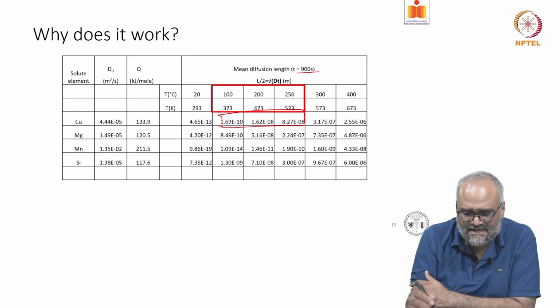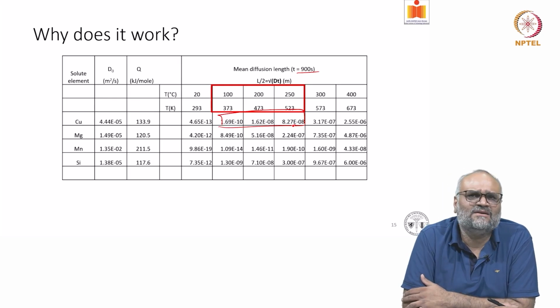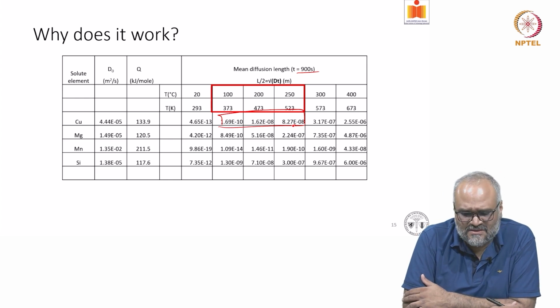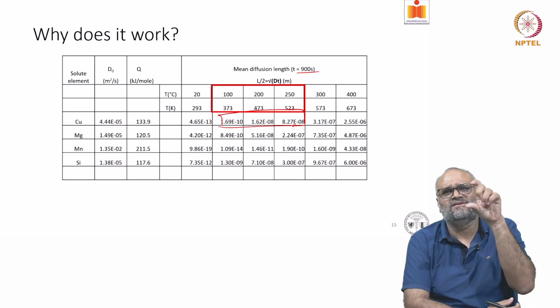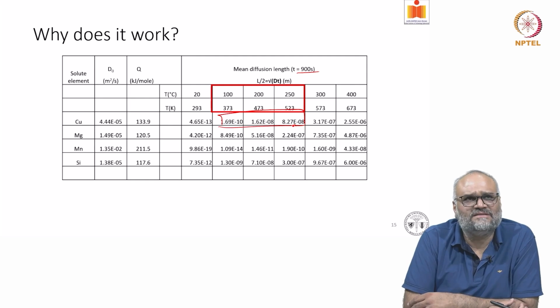So making the specimen thicker than 82 nanometers for copper for this particular temperature range would make it relevant and closer to the bulk observations. And that is why we could see that the precipitates that were formed are trapped before the copper diffuses out of the matrix or out of the thickness of the TEM foil. So this is why you can observe these kinds of things.